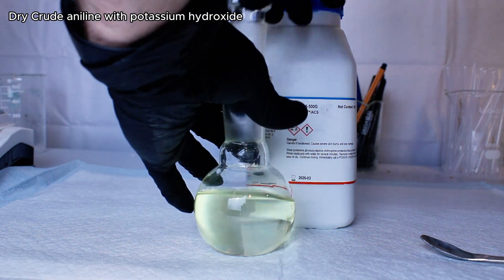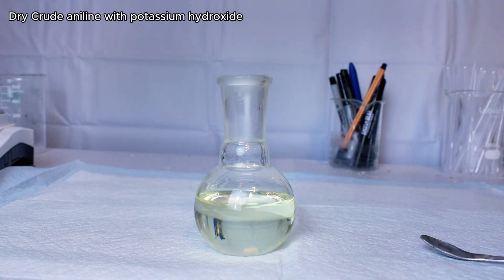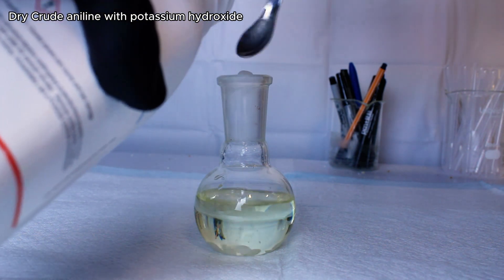Now to dry and purify my crude aniline, I first add some potassium hydroxide and allow it to sit overnight to absorb any water that might be present.